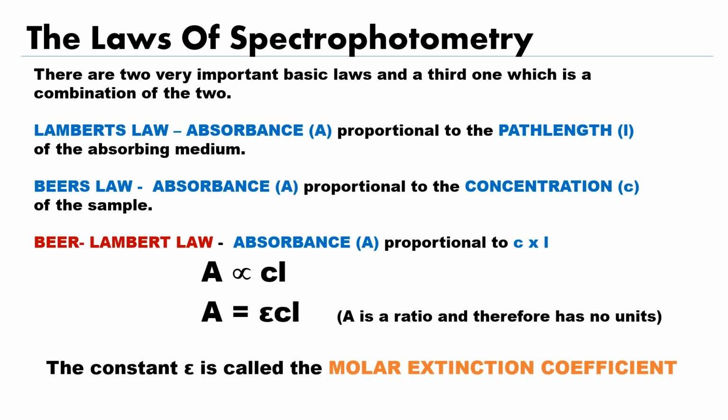What are the laws of spectrophotometry? You are aware that there are two very important and basic laws regarding spectrophotometry, and the third law is a combination of the first two laws. The first law is given by Lambert, and it is called Lambert's law.